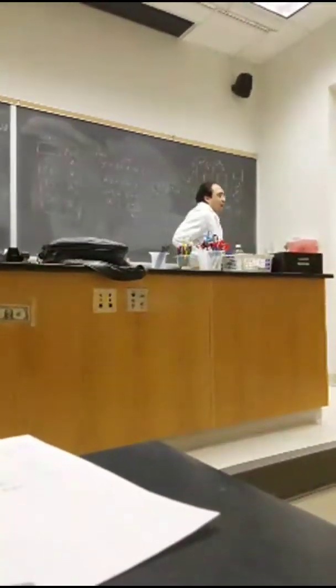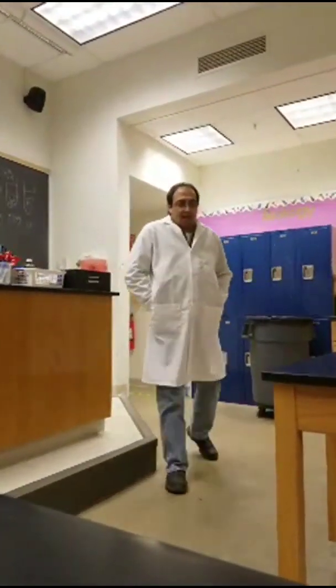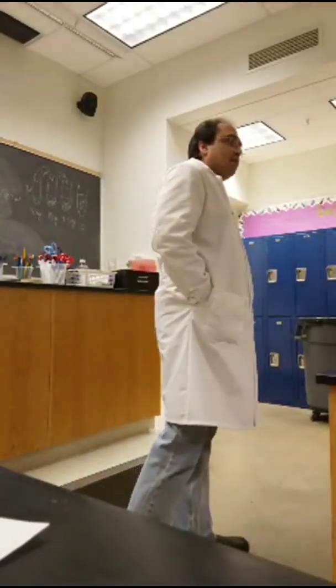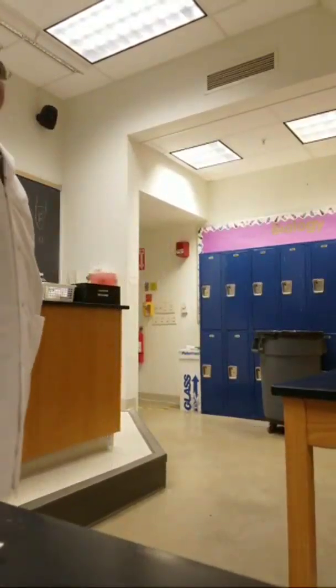So for the exam, from this part, suppose you are given a standard curve, because in the exam you need not prepare the standard curve. You can prepare the dilutions. You will be asked to prepare serial dilutions and take the reading. You need not do the standard curve; I will provide it. I will give you one graph with the equation and the R-square value. Okay, that will be provided to you.